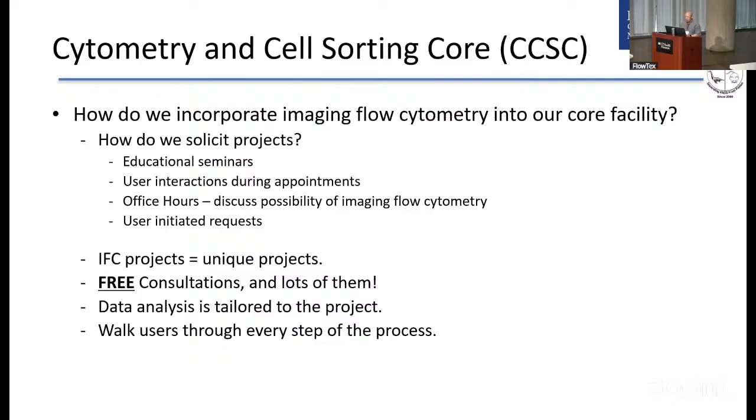So in terms of approaching imaging flow cytometry projects, our general philosophy is to treat them as unique projects because they are unique projects. They're not your run-of-the-mill sorting appointments or analysis appointments. The instrumentation is different and acquisition software is different. Data analysis software is different. The data itself is different. So there's a bit of a learning curve when users want to embark on the journey of imaging flow cytometry. This appeals to some people, others not so much.